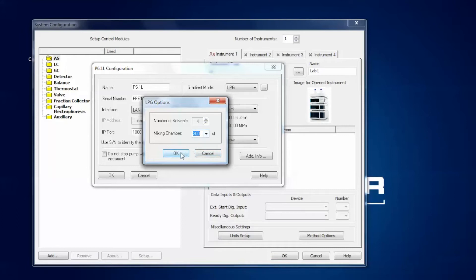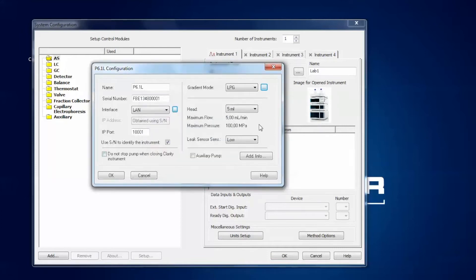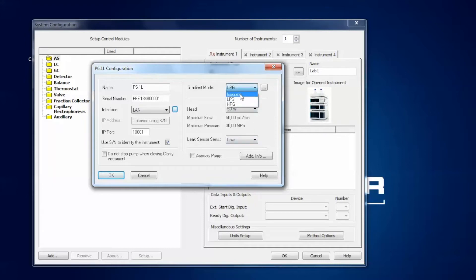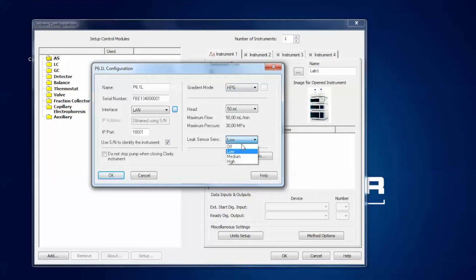The pump head is normally recognized by an integrated RFID chip, but you can also change the settings here to, for example, a 50 mL pump head. In each case the software shows you the maximum flow rate and the maximum pressure. You can also change the gradient mode of the pump to isocratic or HPG. And you can change the leak sensor sensitivity — you can switch it off or select a sensitivity between low, medium and high.